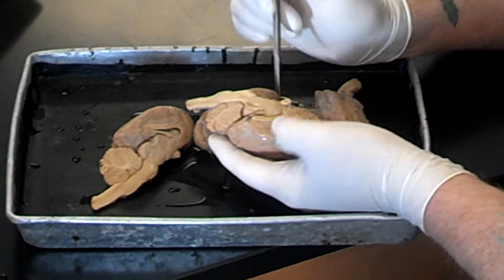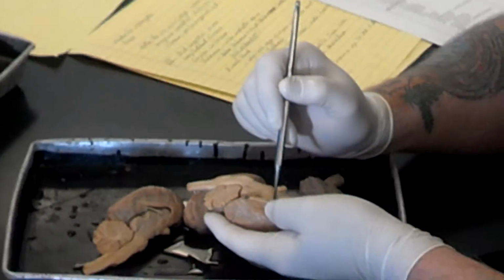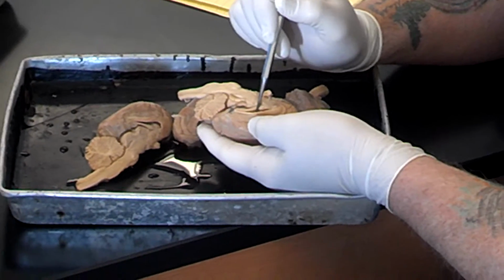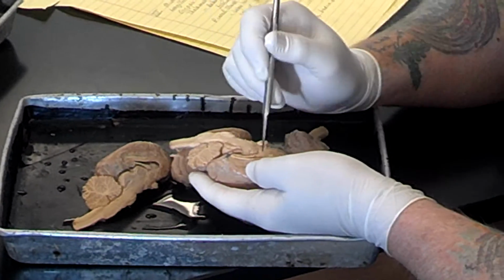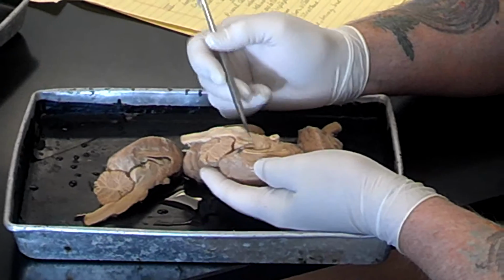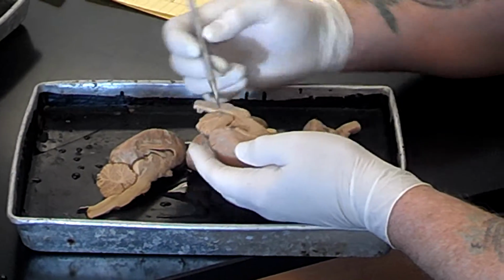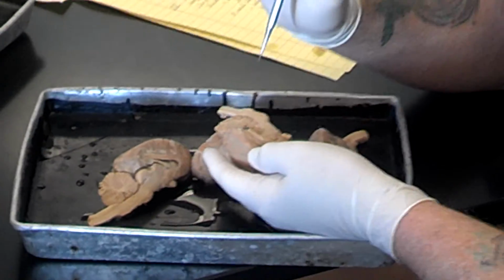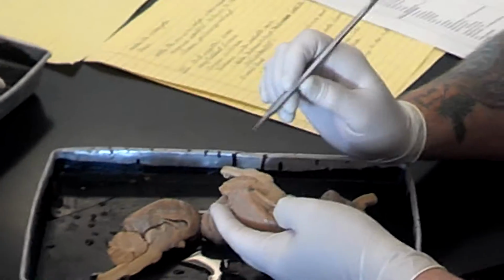Okay, now next semester you're going to look at a few more structures that I'm not going to bother with today, but this is a ventricle. See the big opening? That's one of the lateral ventricles, one on each side. Those are the first two ventricles. Now normally in an intact brain, and I don't have one here that's very intact, there's like a filmy membrane that covers that, and you'll look at that next semester. That covers that and actually separates the two sides.